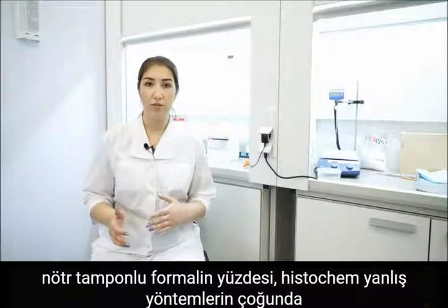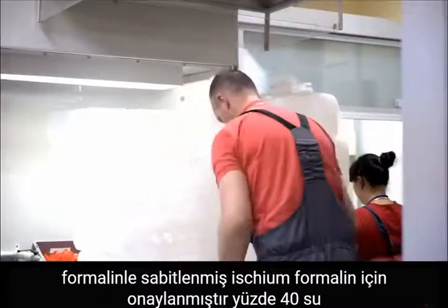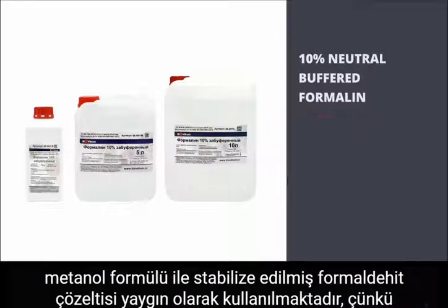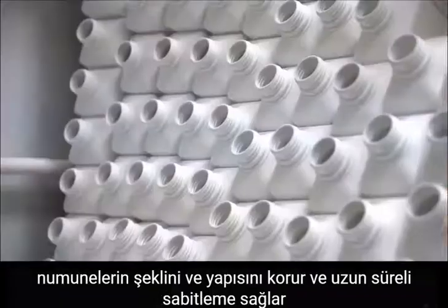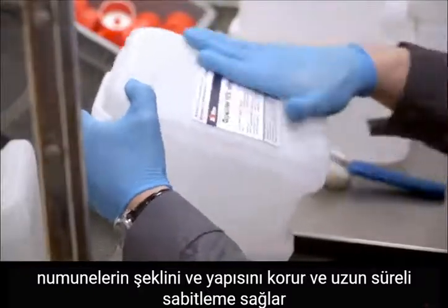The majority of methods of histochemistry are validated for formalin-fixed tissue. Formalin is a 40% aquatic solution of formaldehyde stabilized with methanol. Formalin is widely used because of a number of factors: high speed of diffusion in tissue, the capability to preserve the shape and structure of samples, and provide long-term fixation.